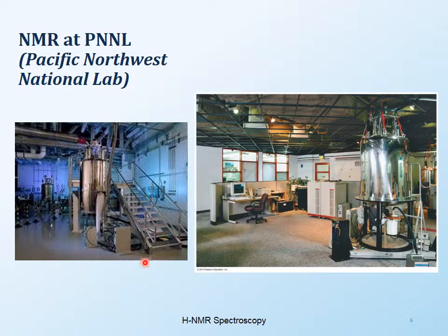So the radio frequency can be from 200 megahertz to about 1000 megahertz. As you get to the 1000 megahertz, you're really getting very good energy flipping going on, and once you have that, you get a very good spectrum. You can detect a lot more at 1000 megahertz rather than 200 megahertz.